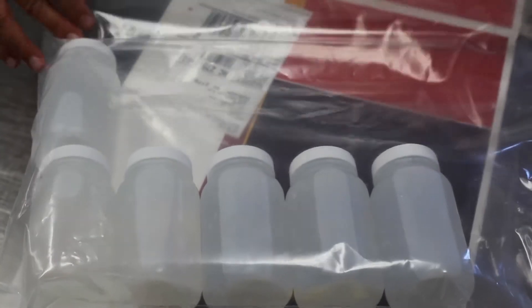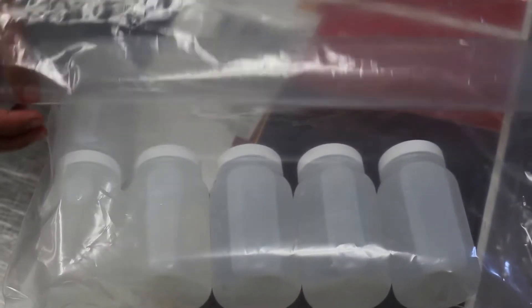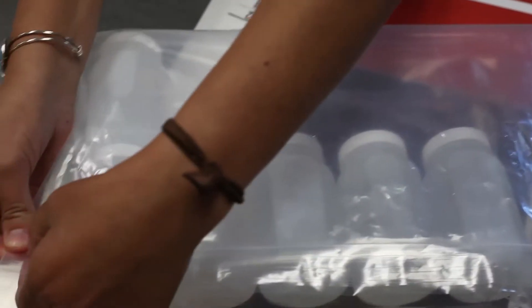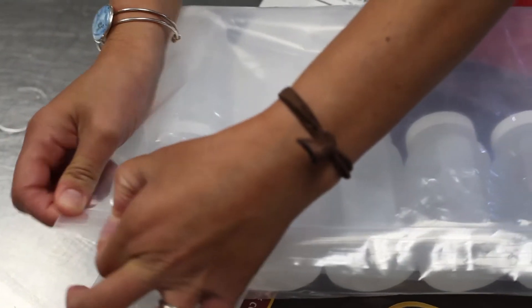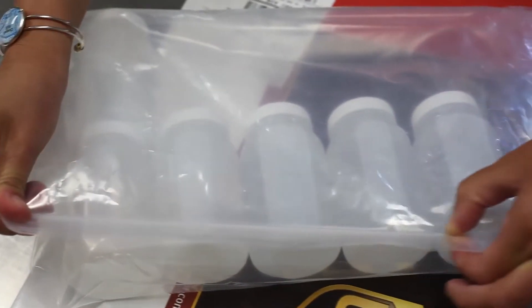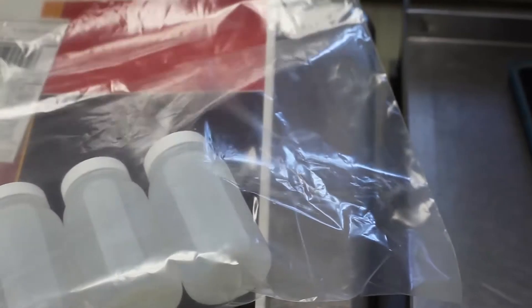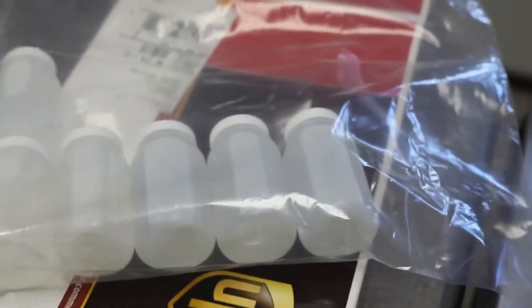Once you put all the bottles in the bag, if the bag is not full you can try to fold it over and zip it up. Seal it well. If you are using all sixteen bottles, just seal it like this.